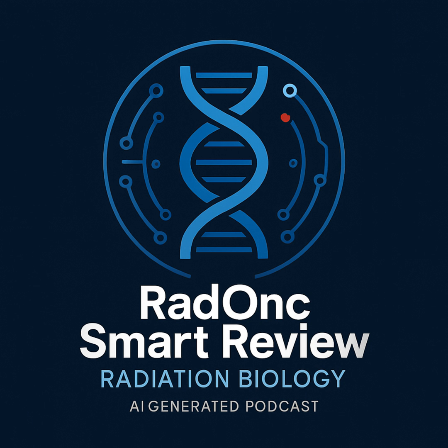Okay, let's pivot now to techniques specifically focused on detecting DNA damage, particularly the kind caused by radiation. The Comet assay and gamma H2AX foci staining are really central here. Absolutely critical for radiobiology. The Comet assay, or single-cell gel electrophoresis, is super sensitive for detecting DNA strand breaks within individual cells. And it gives that really cool visual, the comet shape under the microscope.